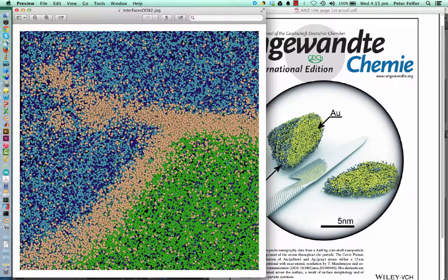You can see an image here that's from a recent paper we had in Scripta Materialia about high temperature corrosion, and you've got the brownish carbon atoms at the boundary. You've got the green nickel atoms, the blue oxygen atoms and the dark blue chromium atoms. This is a very nice visualization for anything that's a cross-section-like image, or anything where you're rather zoomed out. If you're zooming out far enough, anything that's supposed to look like a sphere will look like a circle anyway, so you're not going to have the 3D appearance of it anyway.